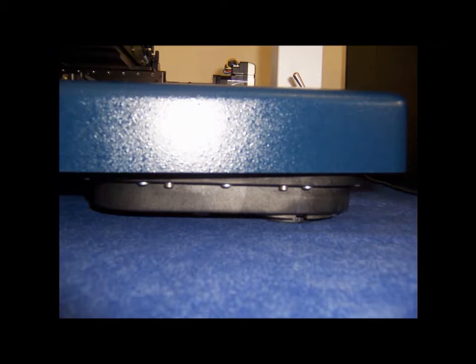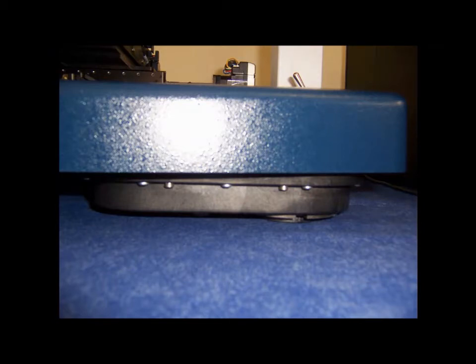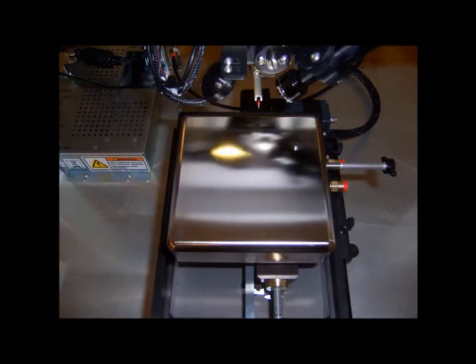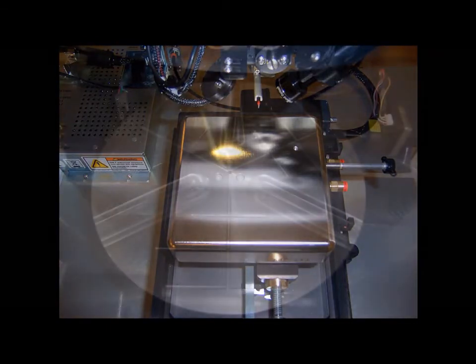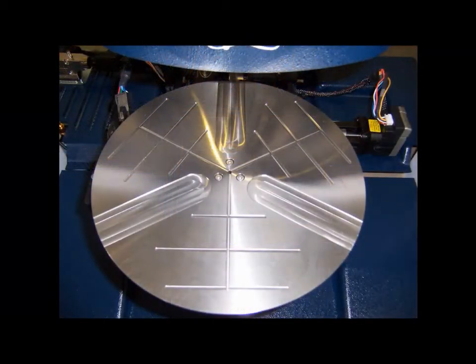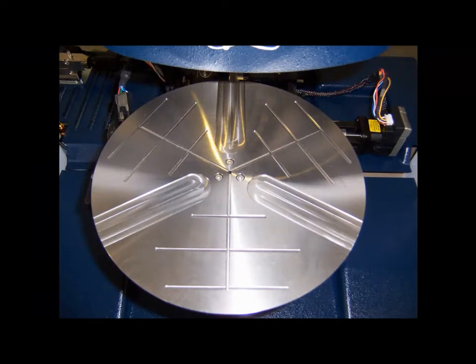The DECTAC XT can be equipped with a variety of sample fixtures from a simple sample block to fully automated theta stages with vacuum capability. All of the fixtures are mounted to the top of the scanning stage.